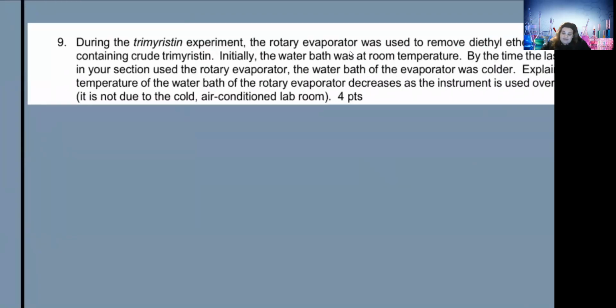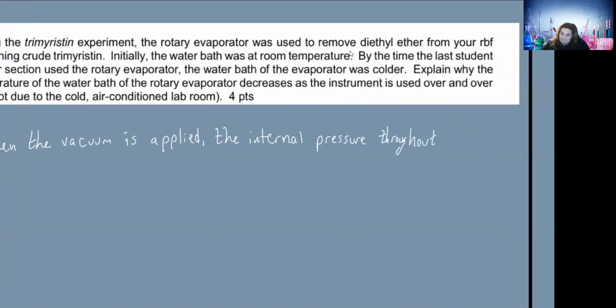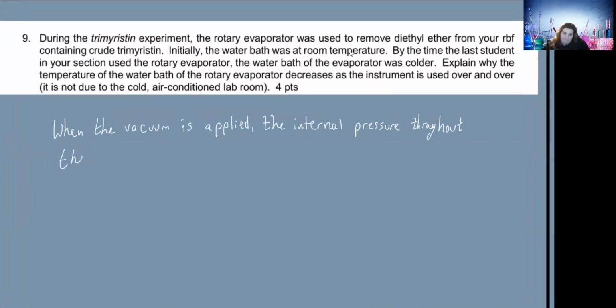Okay, so we can say, let me grab my pen here. When the vacuum is applied, the internal pressure throughout the roto evaporator is decreased.